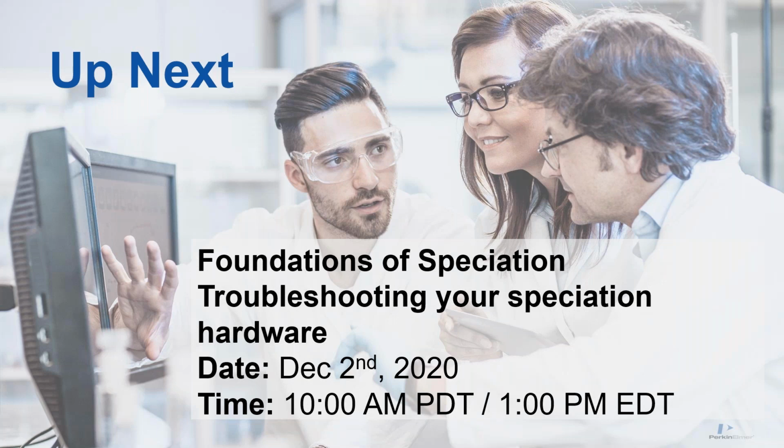Application notes, FYI, there are some handouts here. People were asking about some of these application notes and information on MSF. There's some information in these handouts, and again, you can reach out to us. Also, if you have the software, you can hit F1 in the software and it'll give you some information. When you're in the MSF screen or the IEC model builder, hit F1 and look in your help menu. It actually provides quite a bit of information in the active help menu.